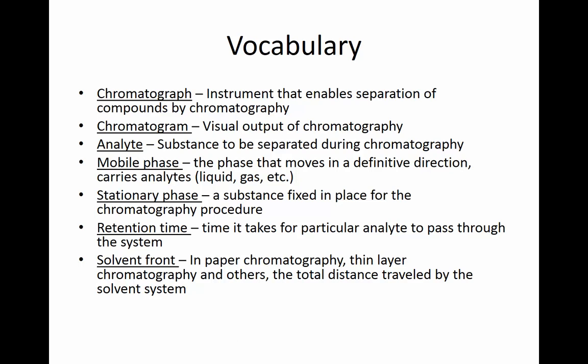Okay, so there's some vocabulary that I'm going to use throughout this recorded lecture here. And there's probably some vocabulary you might hear around the lab, and there's some vocabulary certainly you'll see in the lab manual. And we'll start with chromatograph.